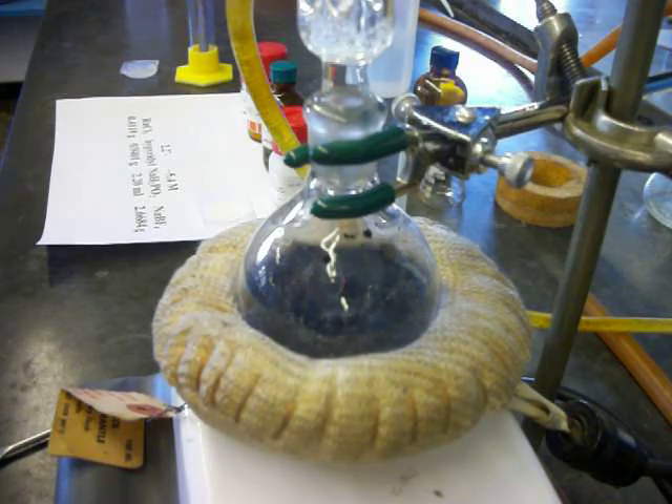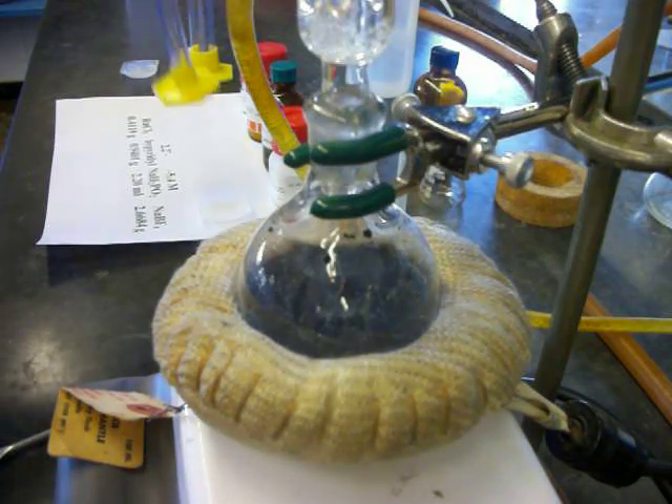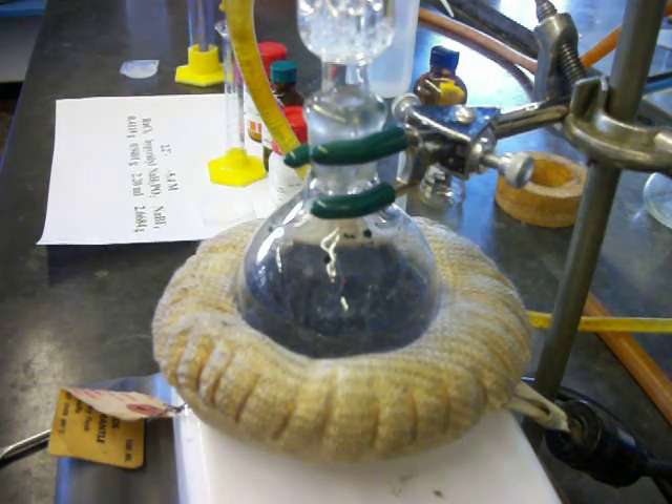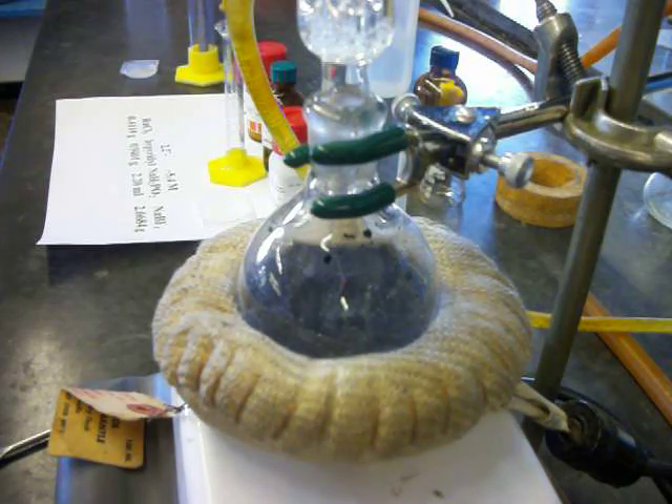I want you to note the color of the solution right now — it has a very black appearance. I'm not going to have the camera on for the full period, but once we get up to reflux, I'll turn it back on and you will see a bit of a difference in the appearance of the solution. So this thing right now is just going to heat up to reflux, and I'm going to turn the camera off for now.